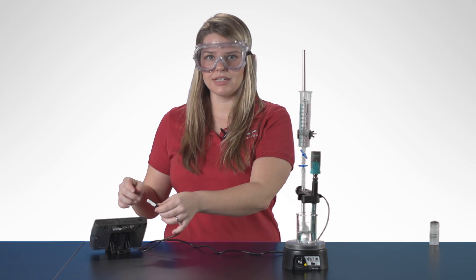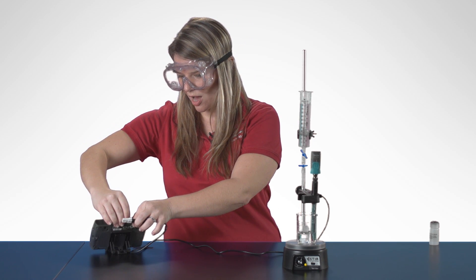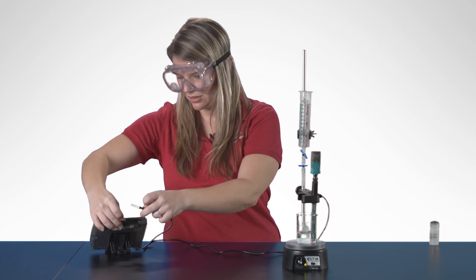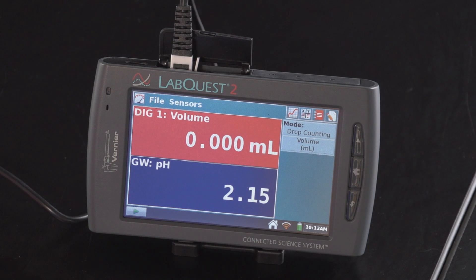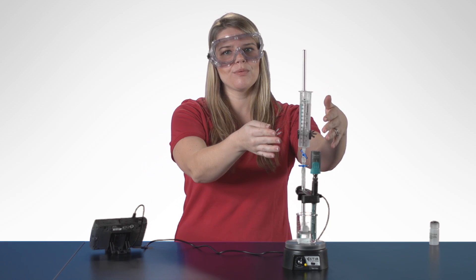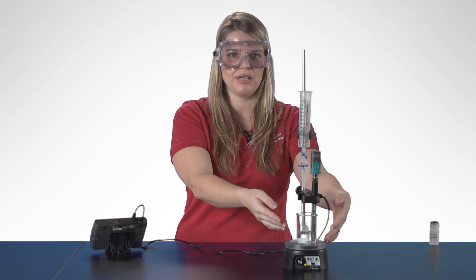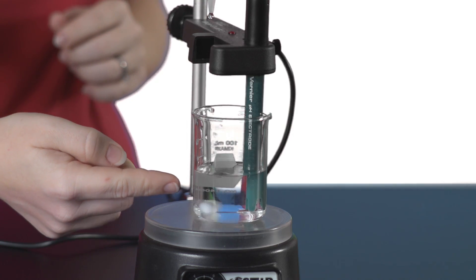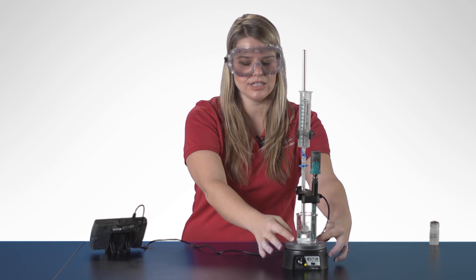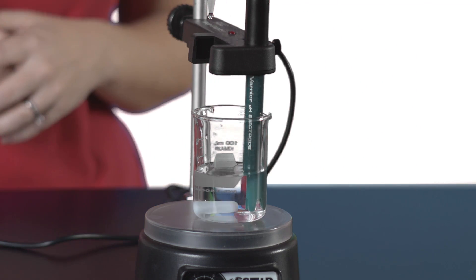Then I'm going to connect the BTD cable from the drop counter to the LabQuest 2. It goes into the top of the LabQuest 2 and will automatically be identified, and the mode will automatically change to drop counting. I've already set up my 0.1 molar NaOH in the burette and my 0.1 molar HCl in the beaker. I want to make sure my burette is lined up with the opening in the drop counter and will go into the beaker. The solution needs to be stirring, and the stir bar — we don't want it bumping into the PH electrode.